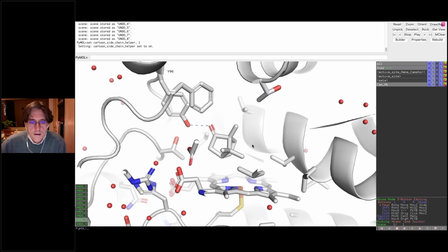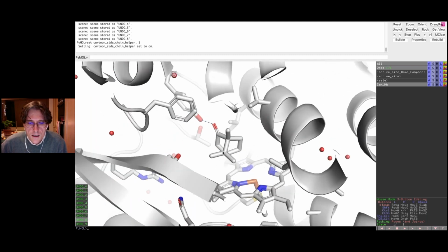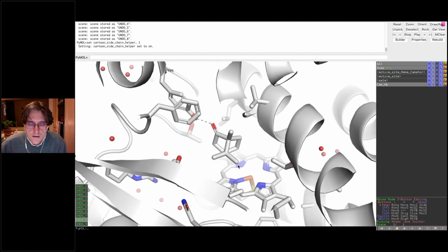Not quite. So in the heme, there are actually 4 bonds to the iron atom. So if I... okay, I'm still on editing mode. That's dangerous. Click out of that. So if you come down to the bottom right and click on viewing again, I'm going to change the level to atoms. So I'm going to shift click on residues and click on the atom.